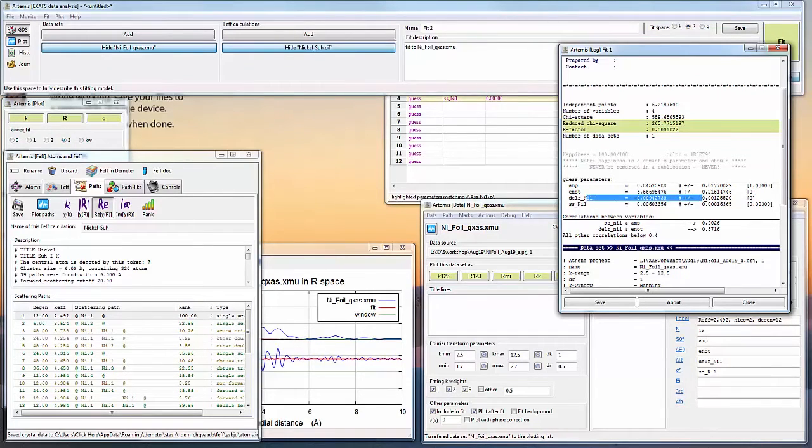Delta R is small, sigma squared is reasonable. So you want to go through each of these values and ensure that they're reasonable. And the previous presentation discusses what those reasonable values are. The happiness factor does go through and check some of these, but you need to do it yourself.